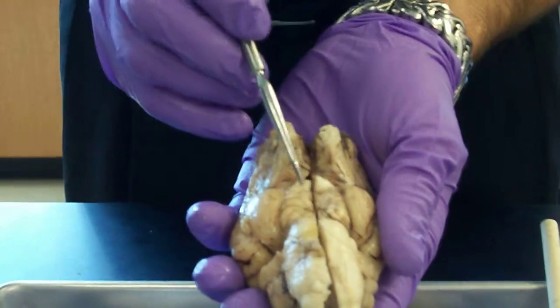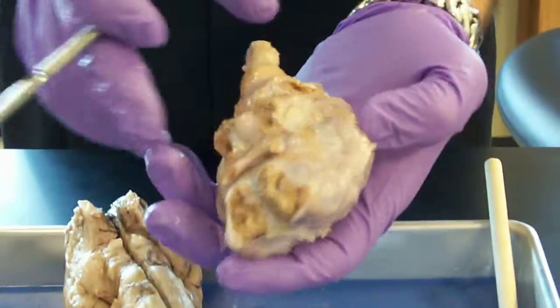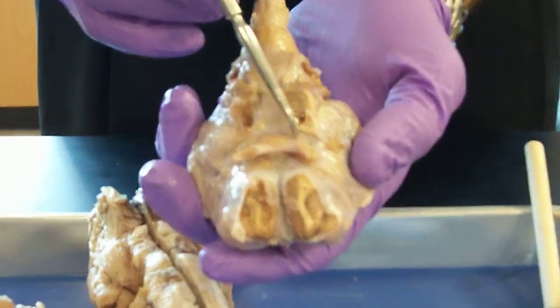The optic nerves, we can see 2 optic nerves right here, and you can see they've been severed. If I look at the whole brain here, we can see 2 optic nerves, but they have not been severed, and so where they cross is the optic chiasma.